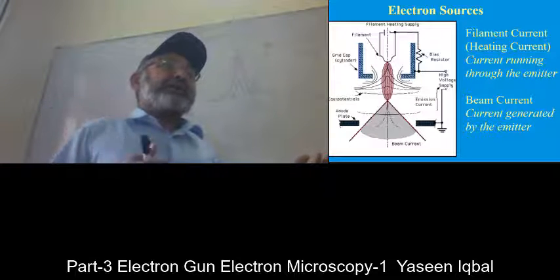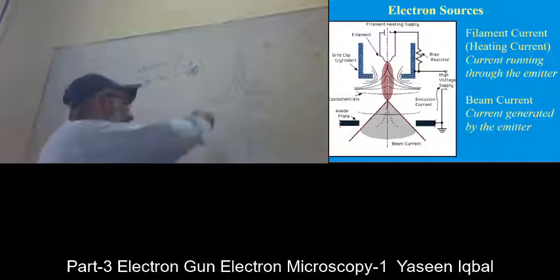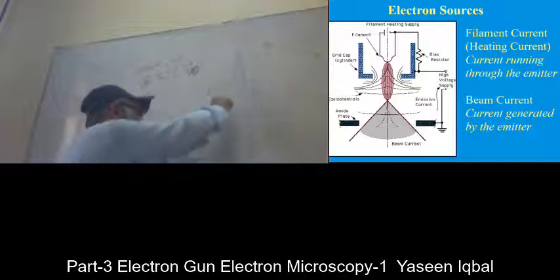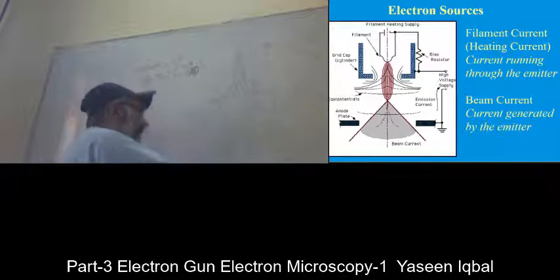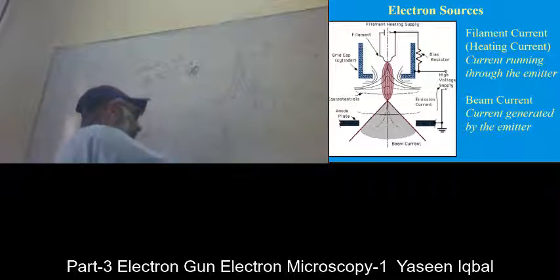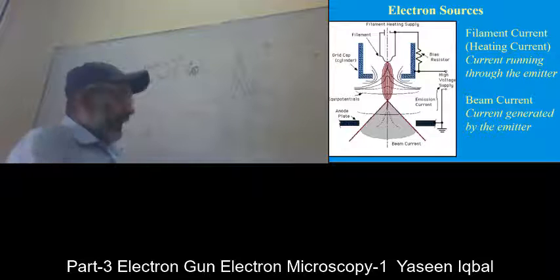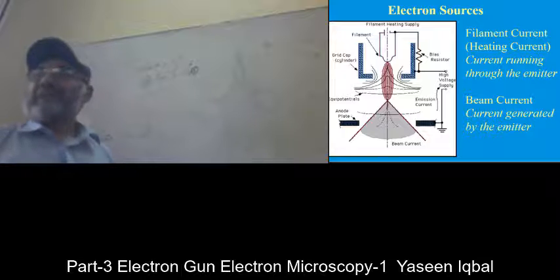In transmission electron microscopy, the transmitted beams are coming like this, and the diffracted beams are coming, for example, like this and like this. You select one and include an aperture to exclude all the others.